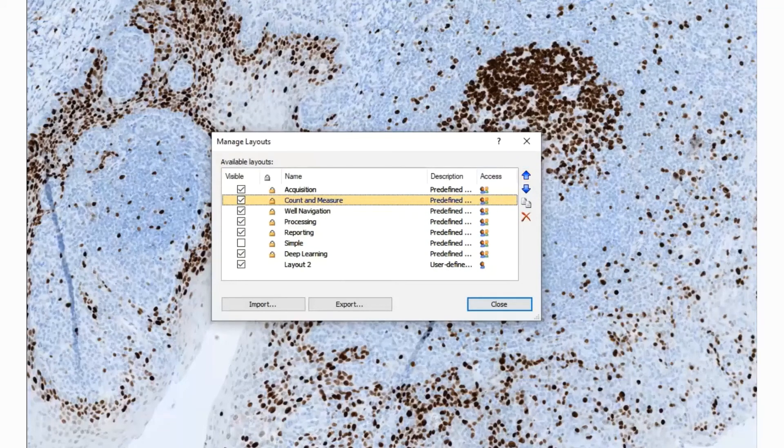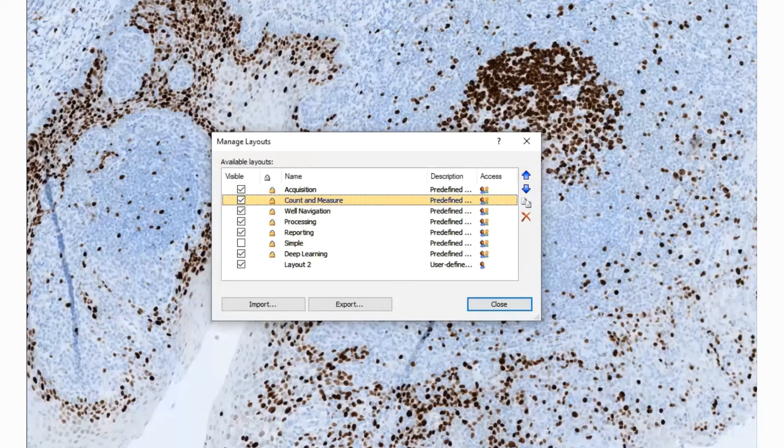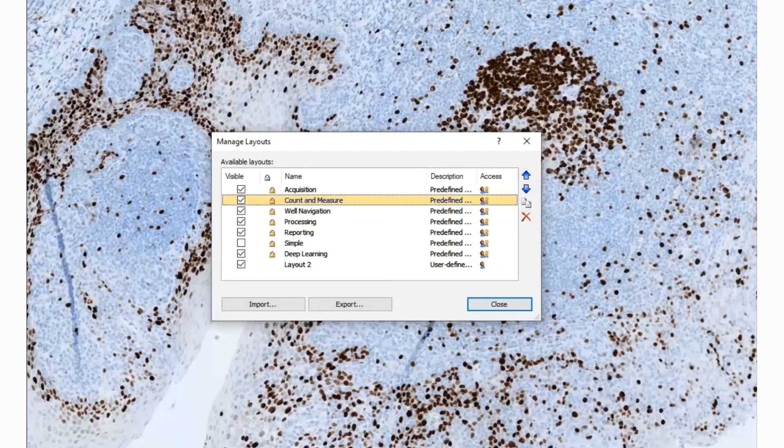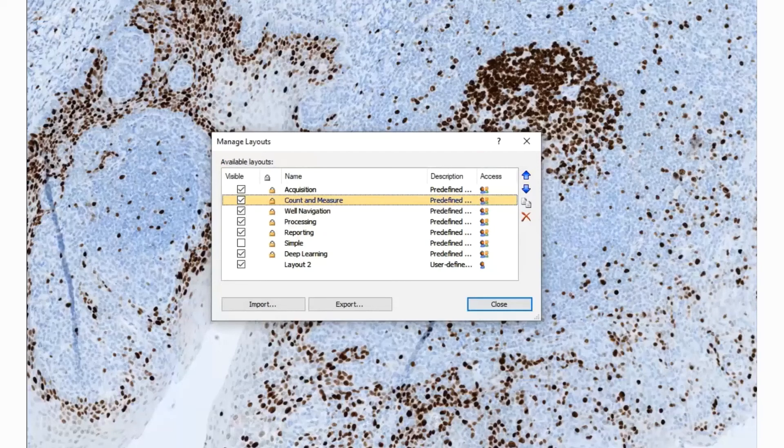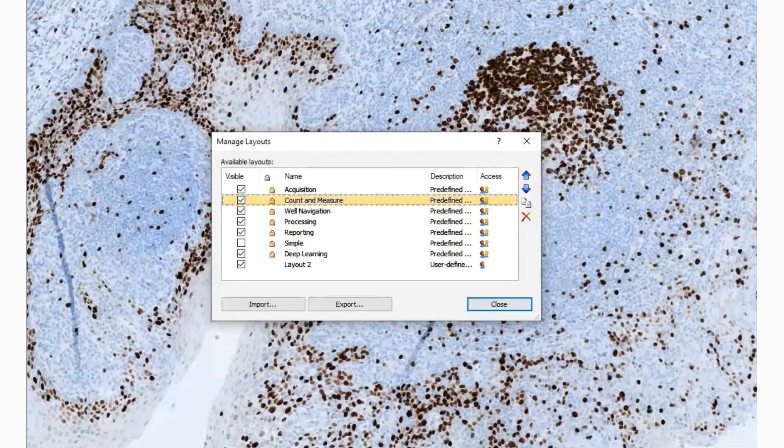By default, pre-configured layouts are available which have been created to help with some of the most common workflows. They are available in Layout, Manage Layouts.